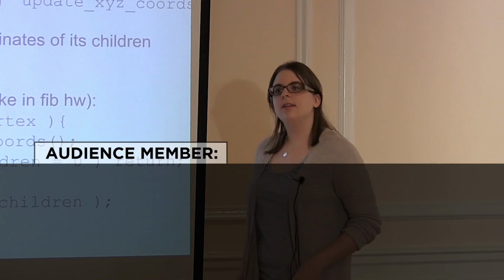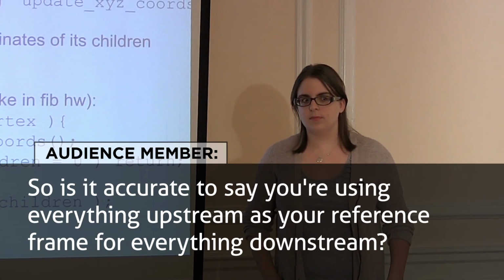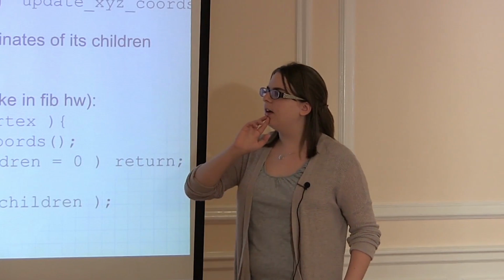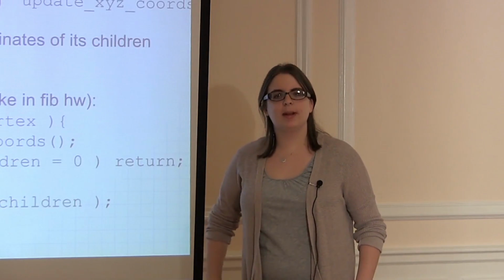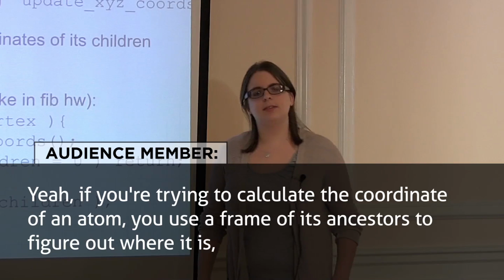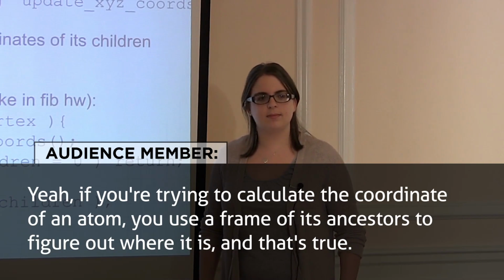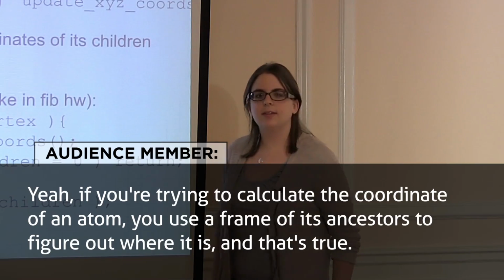So would it be accurate to say that you're using everything upstream as the reference frame and then moving downstream? The question was, is it accurate to say everything upstream is the reference frame? I'd like to say yes, but I'm not sure. Andrew? Yeah, if I understand correctly, you're saying if you're trying to pick the coordinate of an atom, you use a frame from its ancestor to help figure out where it should go. And that's true, yeah. Okay, great.